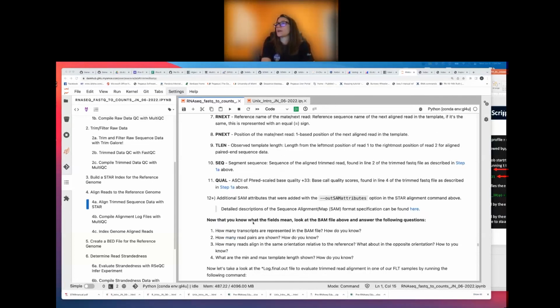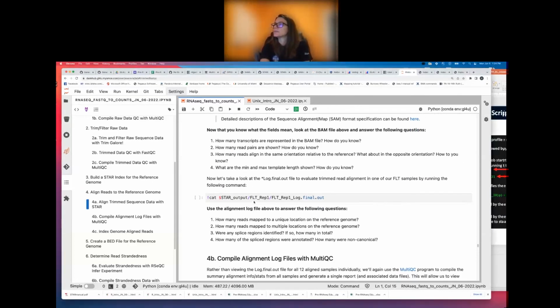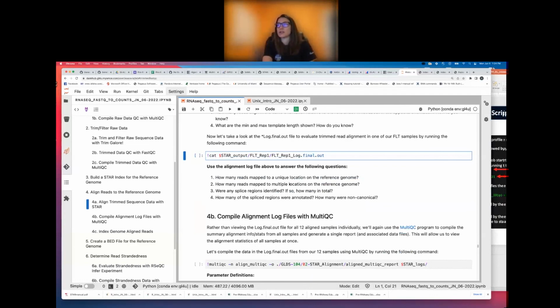Okay. Let's see. Now we're going to take a look at the log final out file. So I did go through this a little bit in the lecture. And we're going to take a look at the log final out for this first sample that we're analyzing, flight rep 1. And we're going to answer some questions.